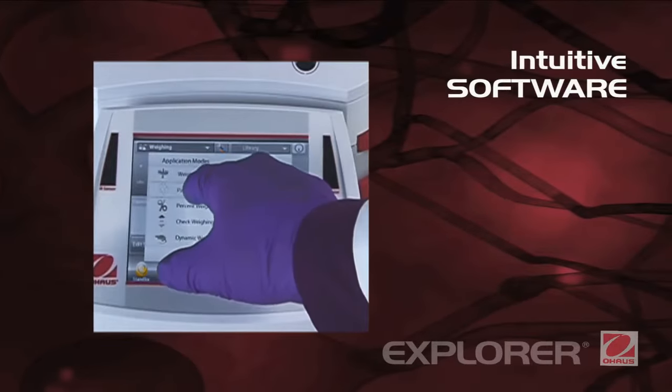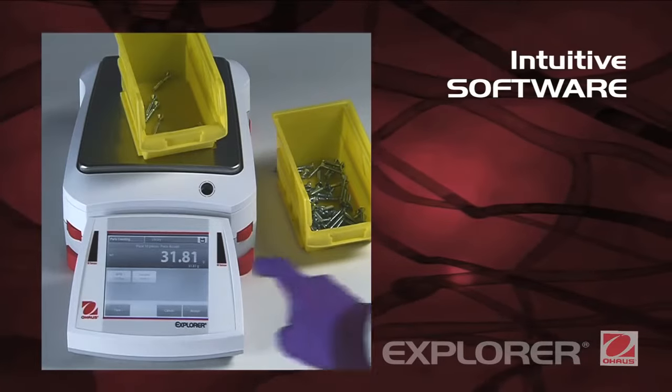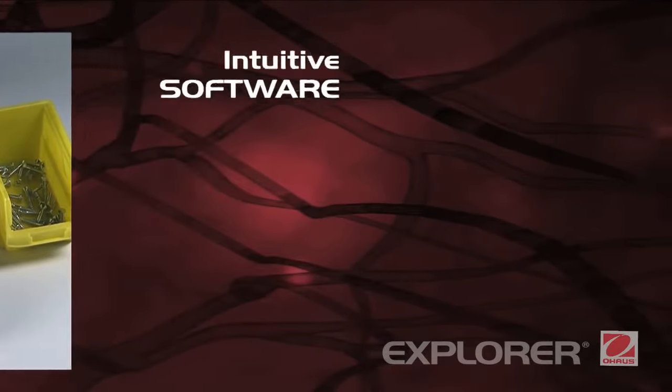Intuitive software. SmartText 2.0 is Ohaus's easy-to-use graphical software featuring 14 applications, QWERTY and numeric keypads, and minimum weight indication.